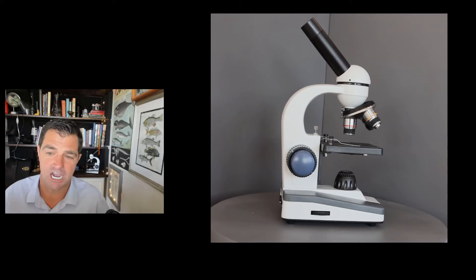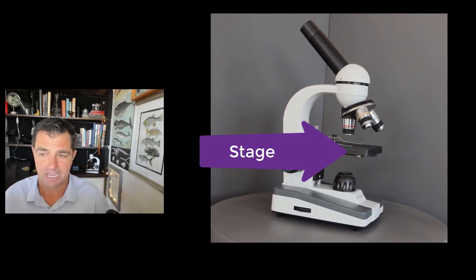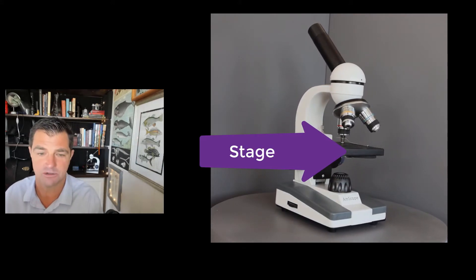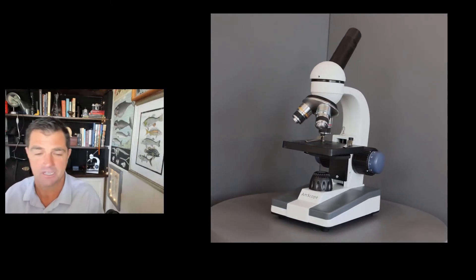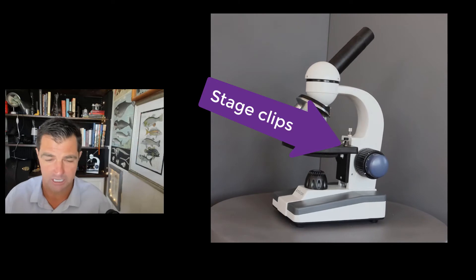Next, we have the stage, which is where the slide will go. The slide is held down by the stage clips that you can see here. Down here towards the bottom of the microscope, we have two knobs.